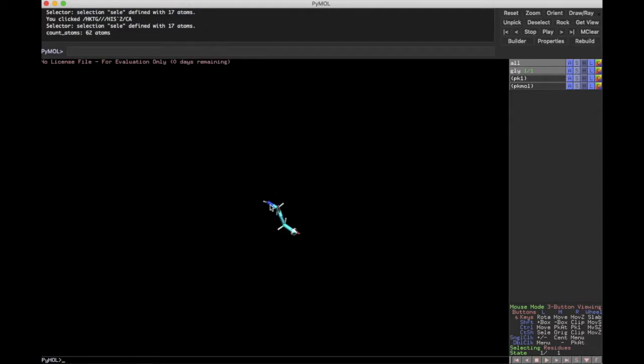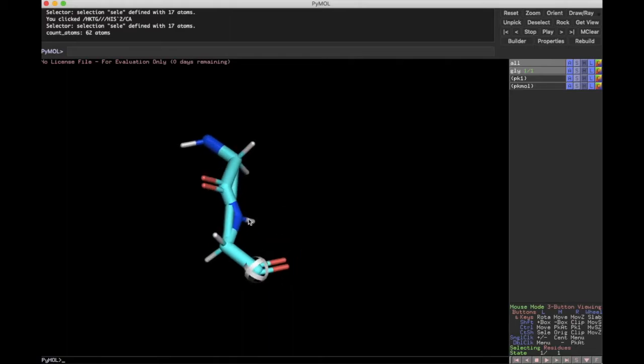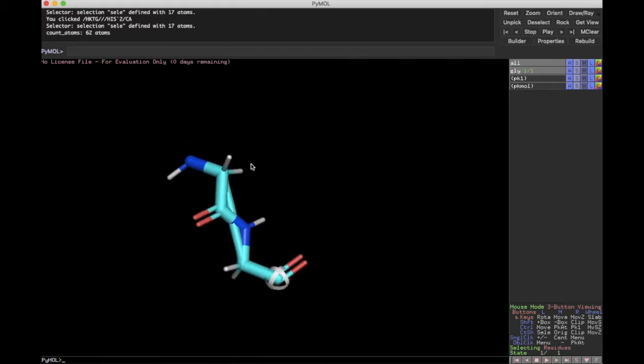It's going to continue building, and you'll see this little tiny sphere here, and this little sphere indicates the central atom in which you're adding a new molecule onto, okay? And so in this case, you'll see here that this is the C terminus, and you remember when a ribosome creates a protein, it always creates it from the N, the amino terminus, which is over here, in the C terminal direction, right?